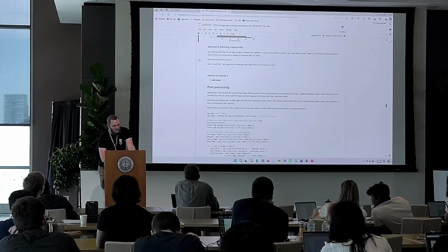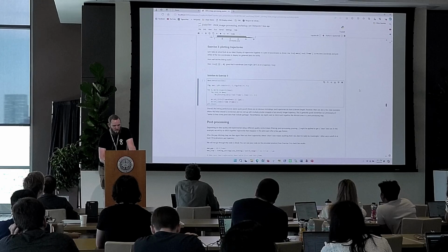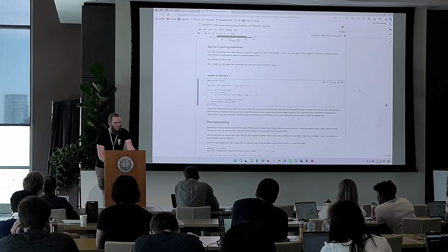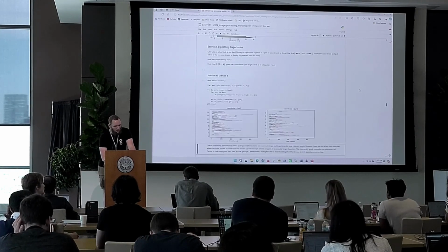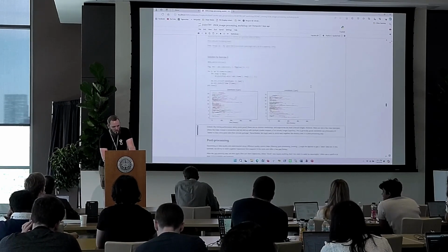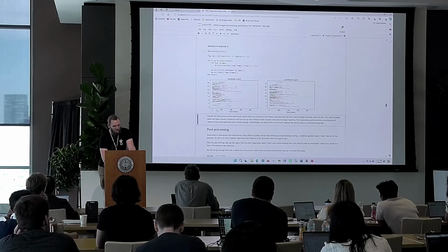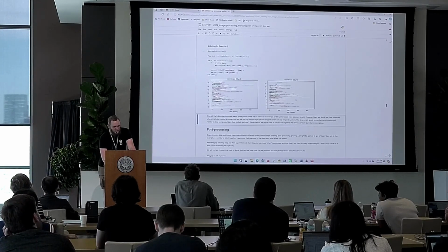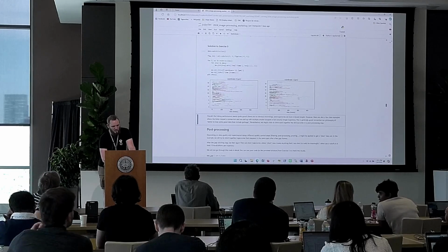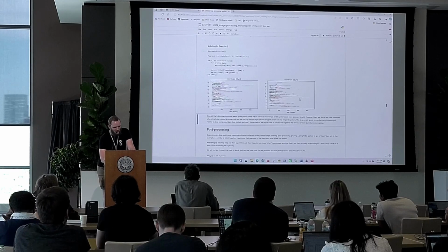So now this exercise 3 here is also kind of fun. The idea is to take a look at how our linking results work. We're just plotting all the trajectories, and here what I'm plotting is always each single coordinate in the trajectory versus time. And what you can see is that overall this looks pretty decent. We have this trajectory here, for example, which is just nicely detected and linked as one trajectory.